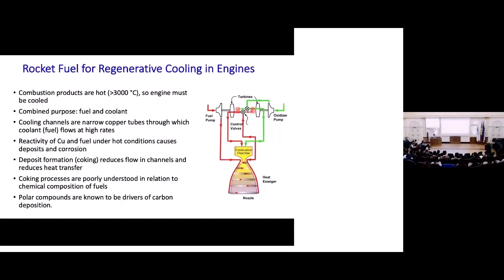As I mentioned, a lot of this has to do with the carbonaceous deposits in the fuel engines. While it's been noticed that fuels with large amounts of polar compounds may react and form a lot of deposits much faster, that's just an overall view. These fuels generally don't get tested afterwards to find the exact nature of what is underlying it.